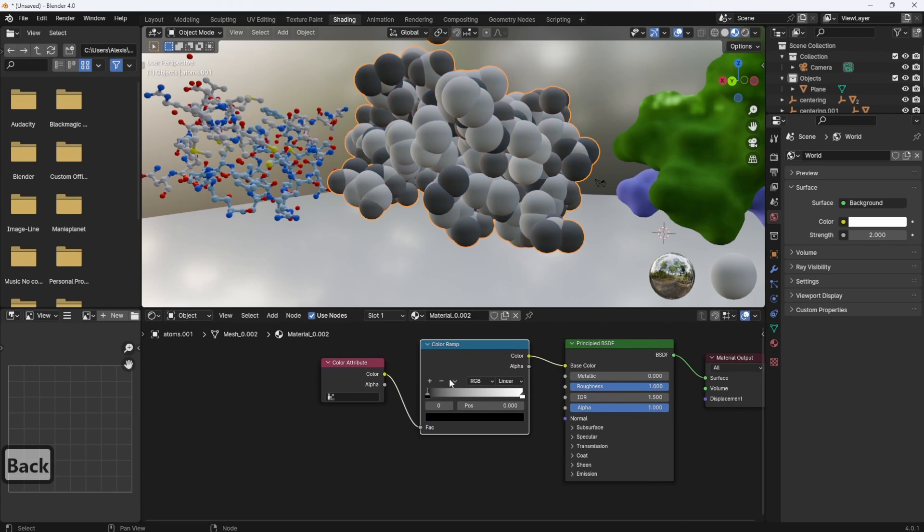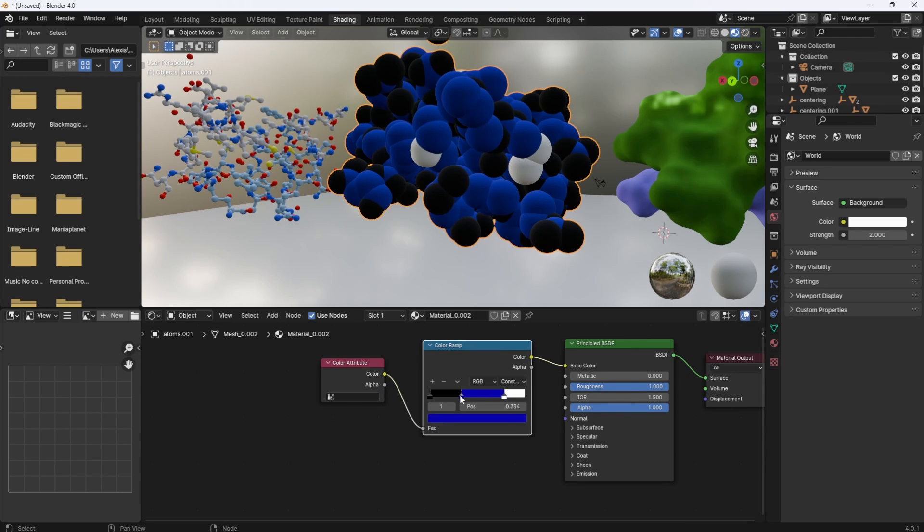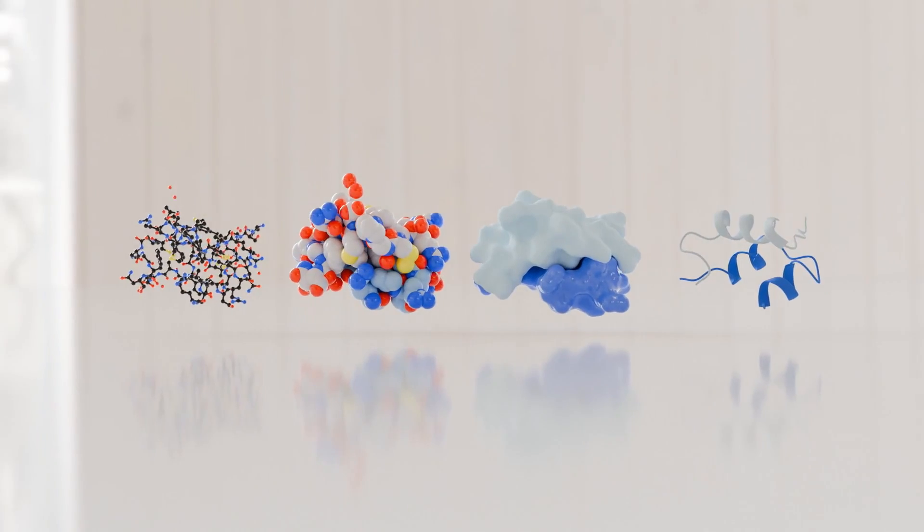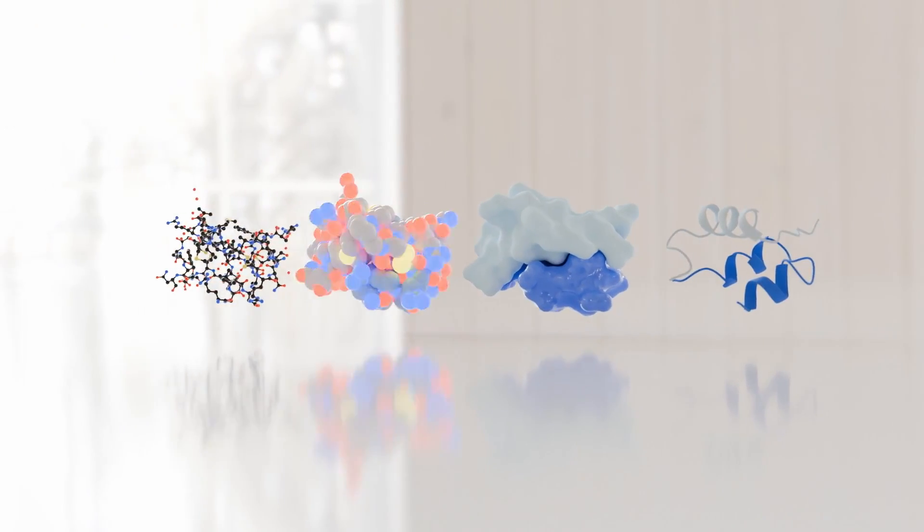If there are more than two colors, it's a bit laborious, but it does the trick. And there we go. Now have fun and bring your research to life.